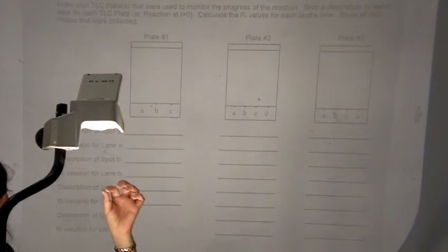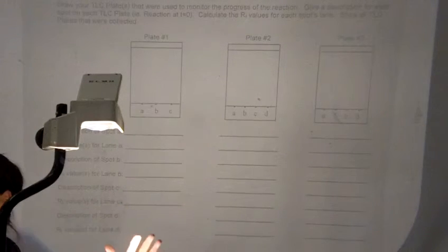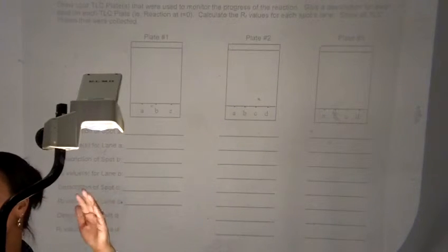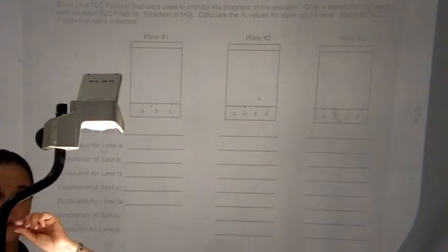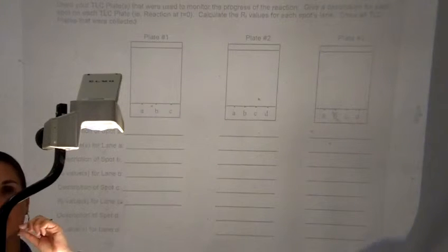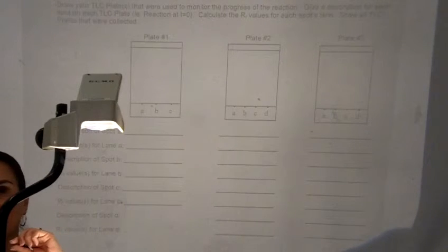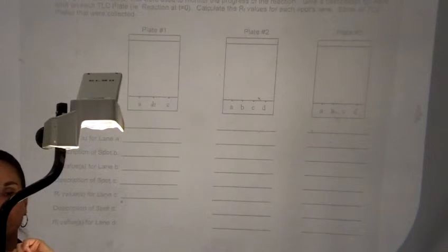If your Rf values are a little bit decreased from what they should be, it's not because of impurities. Something else happened. So if you see 1 spot, but it's a little bit smaller Rf value than it should have been, it's not like a melting point where you can say, well, it was a little depressed because of impurities. That's not how TLC works, okay? 1 spot shows purity, all right?